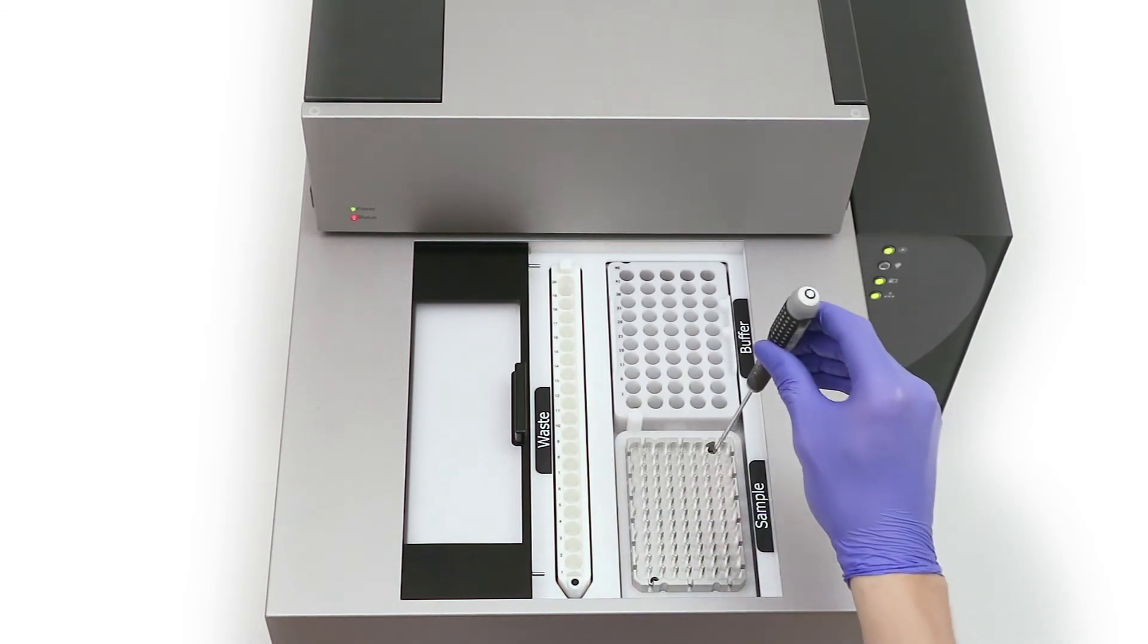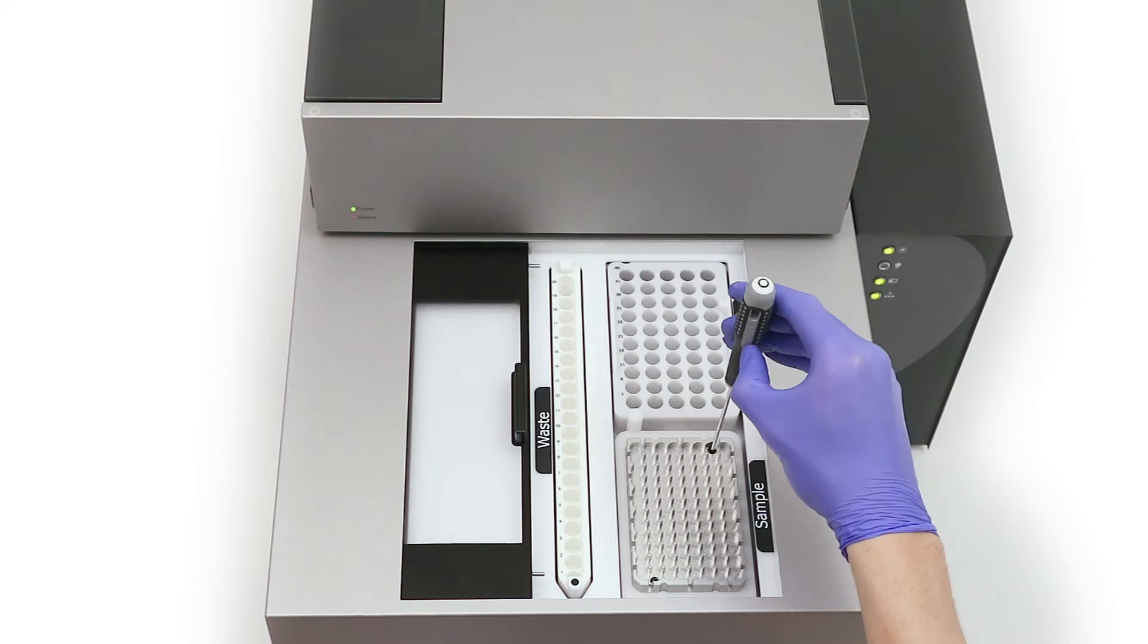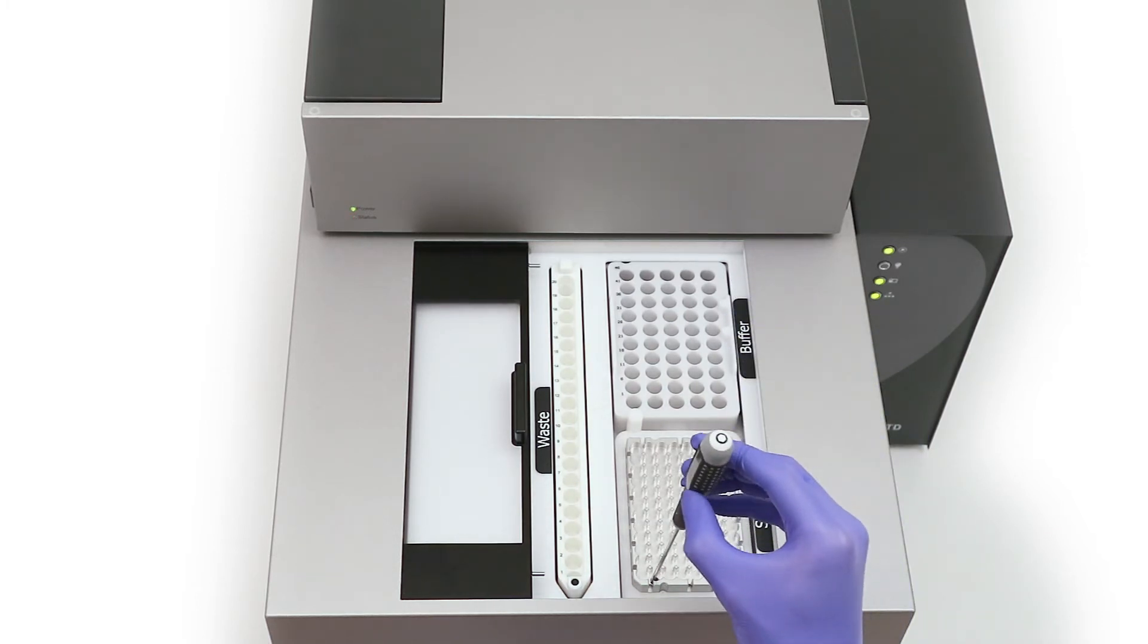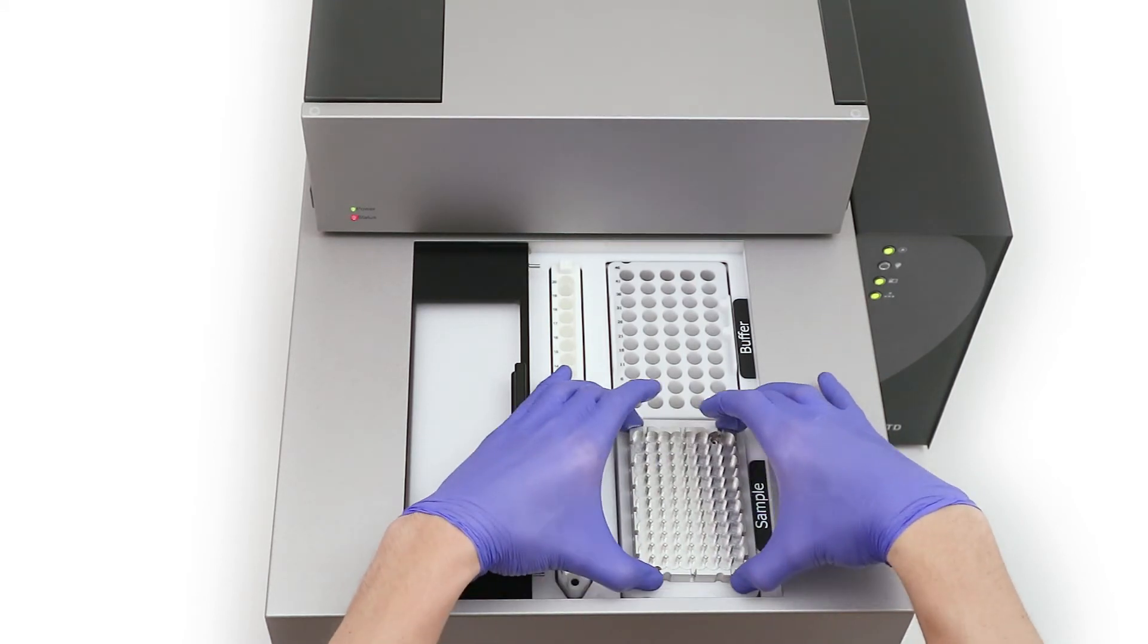Locate the two adapter screws. Using the allen wrench, push down on these screws and turn them one quarter turn counterclockwise to release them. Now gently pull the adapter out of the autosampler and put to one side.